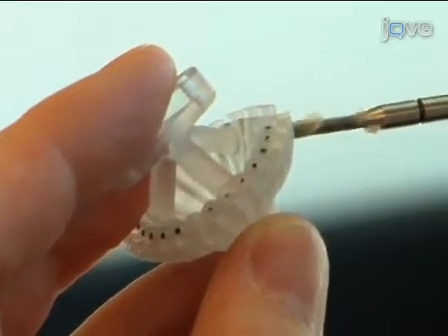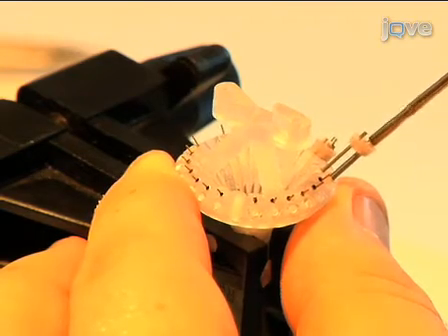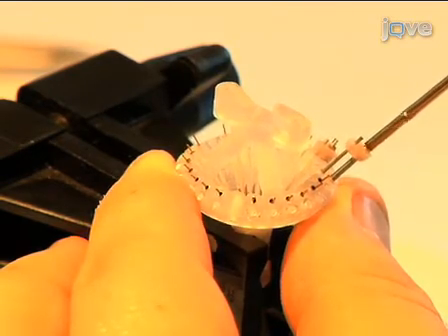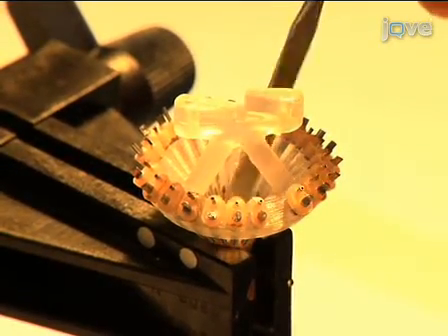Perform a rigorous quality check of the fabricated microdrives. Make sure the screw and the support tube are parallel and that the screw turns smoothly without play. Be careful when using glue or dental acrylic to not accidentally clog any of the tubing.